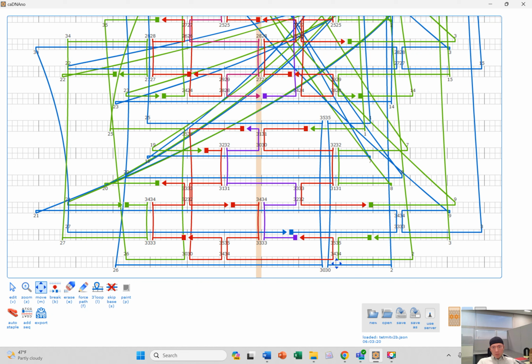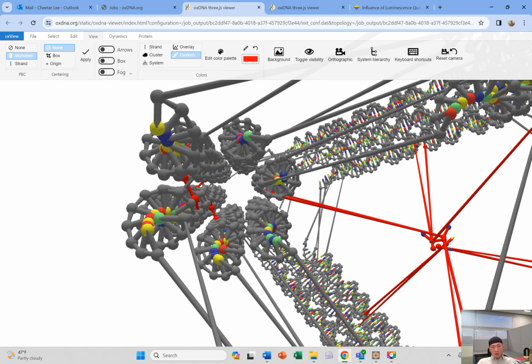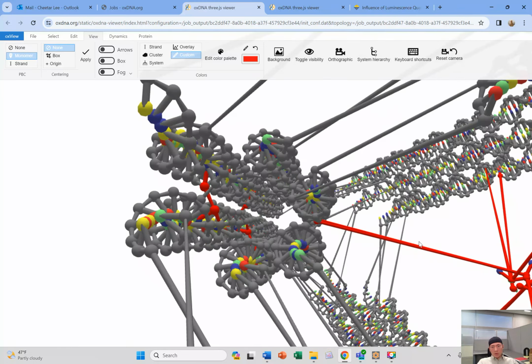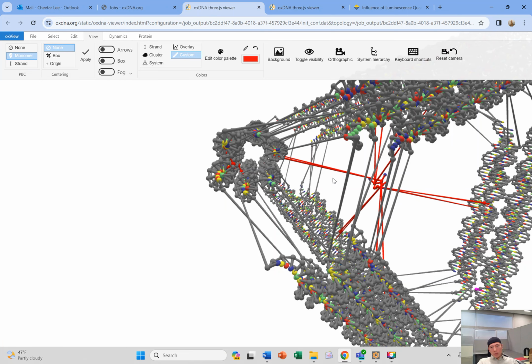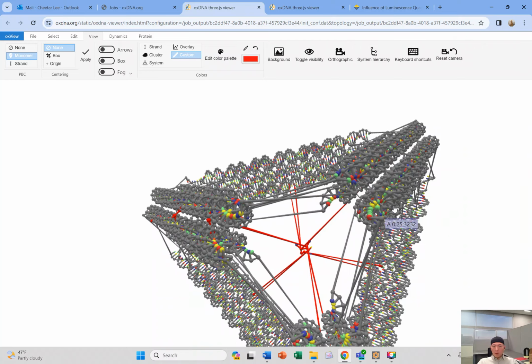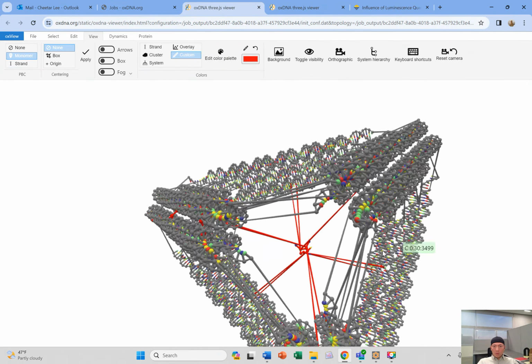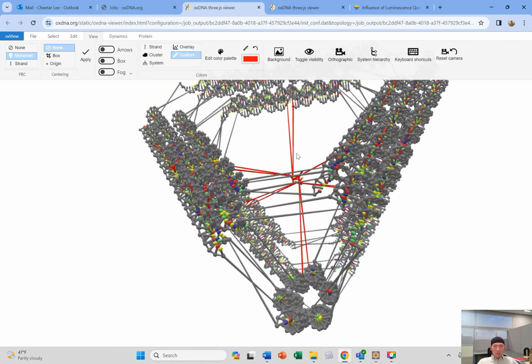Anyways, again, we have different types of helices. So we examine this bundle. They're all connected to each other with staples or with the scaffold itself through Holliday junctions. And we have two inner helices on this honeycomb bundle. The two inner helices point towards the interior of the tetrahedron. If I zoom out, you can see that there are two inner helices that point towards the inside of the tetrahedron. And this is for all bundles. So if you look at this bundle up here, there are two inner helices that point to the interior of the tetrahedron, and likewise here.